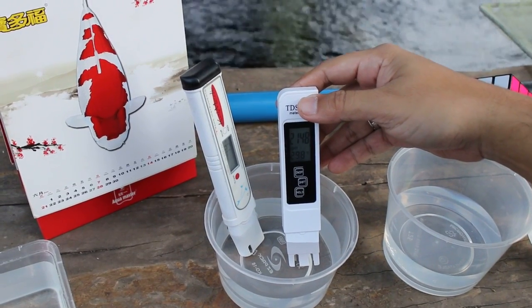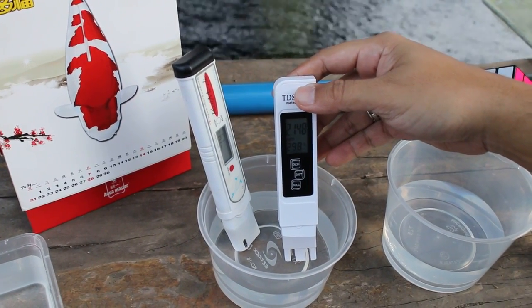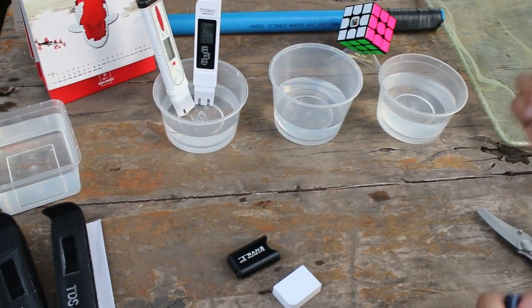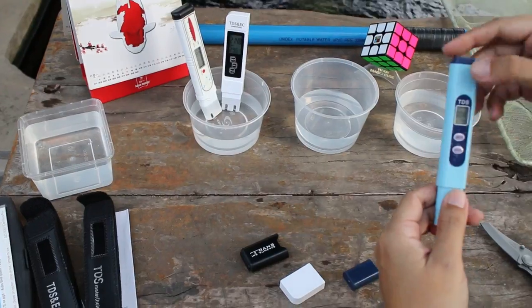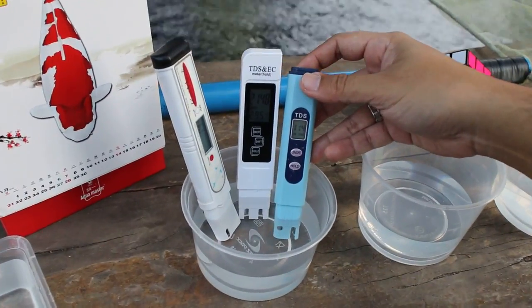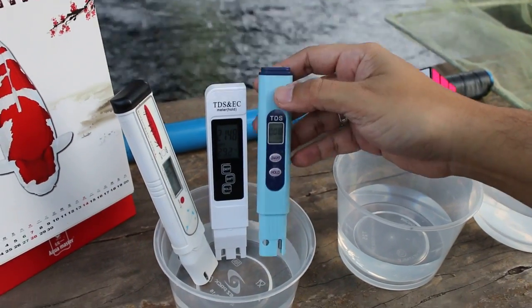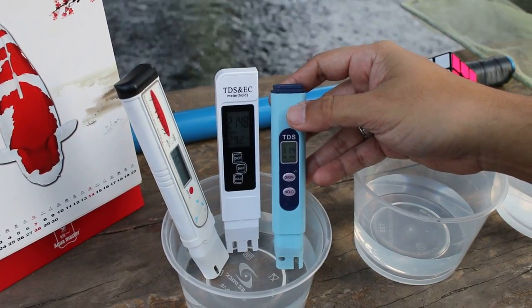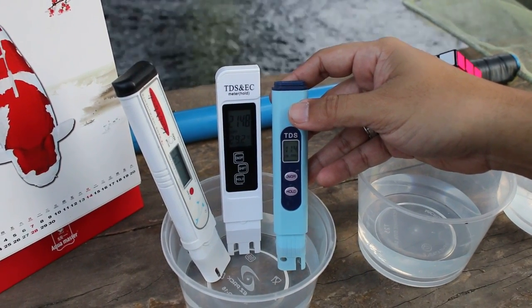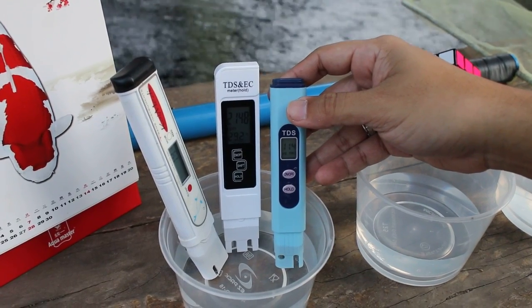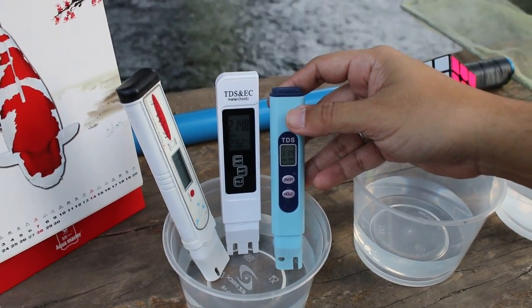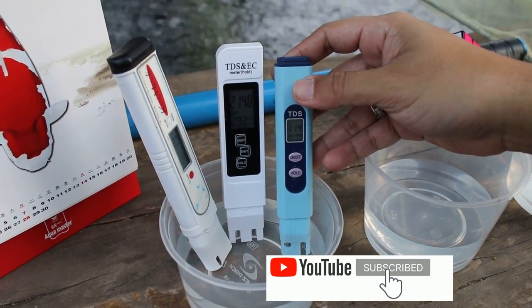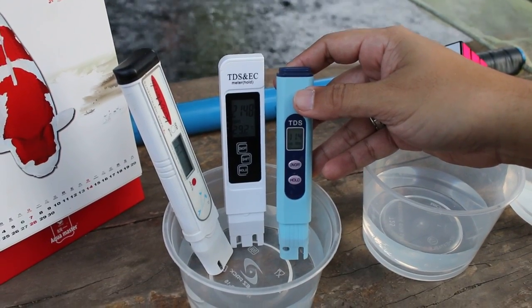So there's a difference of 0.2 parts per thousand from the reading given by coin medic. The second unit from online, it's giving me 114 times 10 ppm. If I do that, we'll have 1,140 parts per million, and to convert that to parts per thousand, that would only be 1.140 parts per thousand, which is quite far from 1.9 parts per thousand.